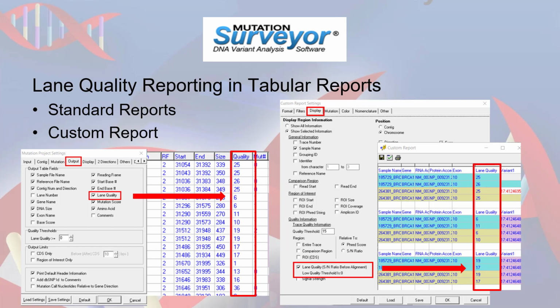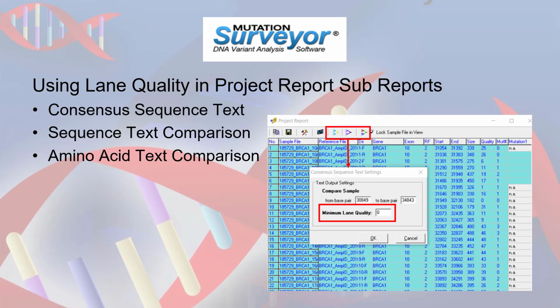Lane deletion can be performed through these tabular reports through the Context menu option. The project report utilizes lane quality as a filter for some of its subreports, such as the consensus sequence text comparison and the amino acid text comparison reports.